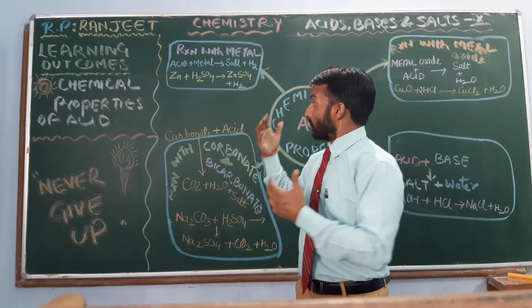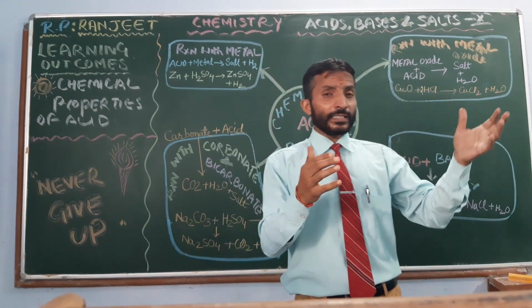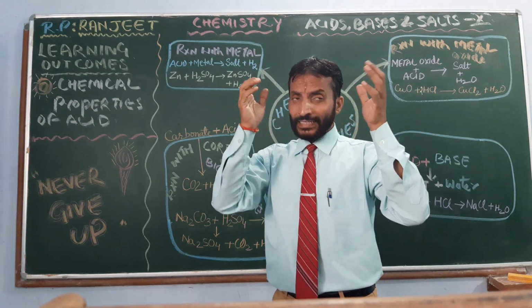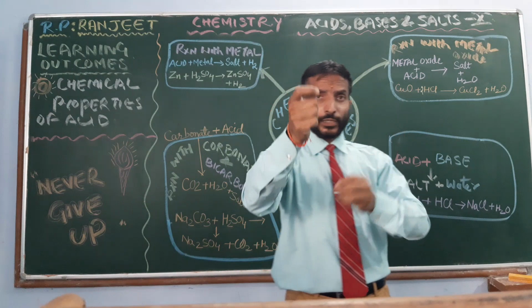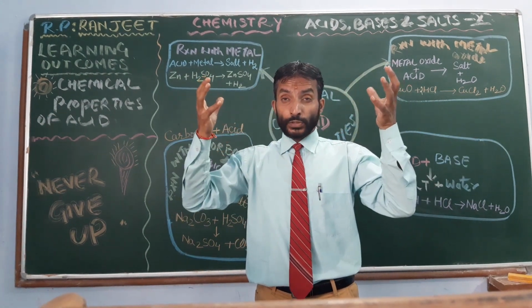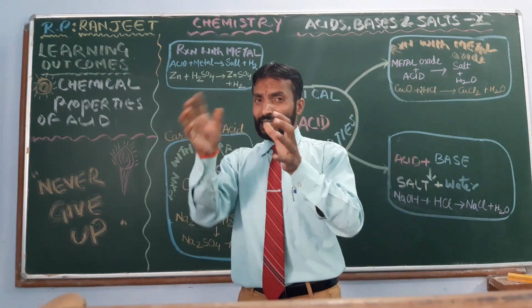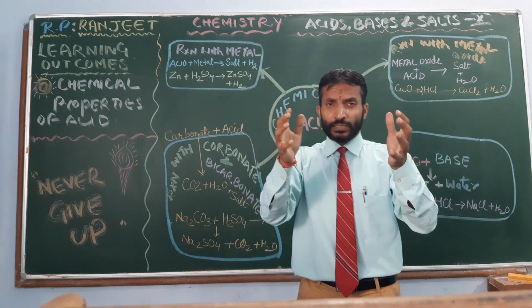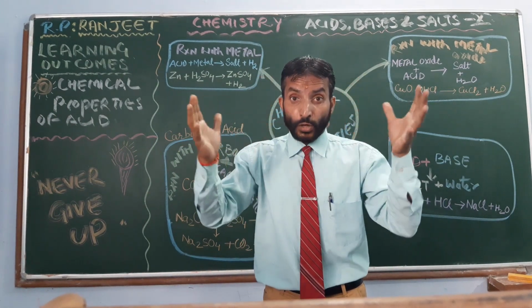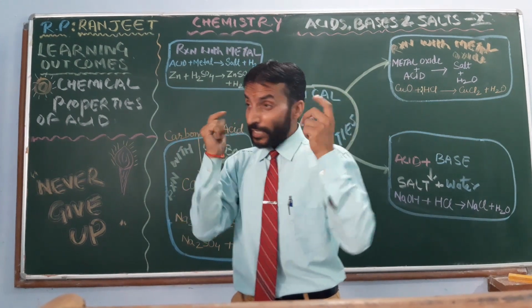So how do we check practically that it is hydrogen gas and not another gas? Remember, whenever you bring a burning candle or matchstick near hydrogen gas, it burns with a pop sound. Why does it happen? Because hydrogen reacts with the oxygen present there and there is a small explosion, but the amount is small, so it comes in the form of a pop sound. Let us check practically to understand the concept.